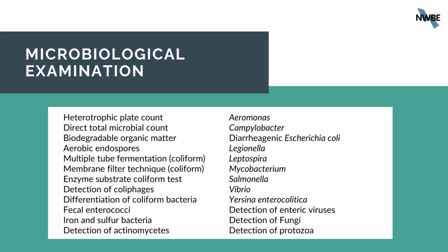I just wanted to cover one more class of methods in Standard Methods, and that is microbiological examination. Most of these are culture-based methods, such as for heterotrophic plate count, coliphages, fecal enterococci, iron and sulfur bacteria, Legionella, Leptospira, and so on. But there are also staining and epifluorescence microscopy approaches for the direct total microbial counts, and bioassays analogous to BOD measurements. That's for the biodegradable organic matter. To my knowledge, none of these methods rely on molecular techniques, but this may change in the future. On here, you'll see coliform, fecal enterococci, and E. coli.